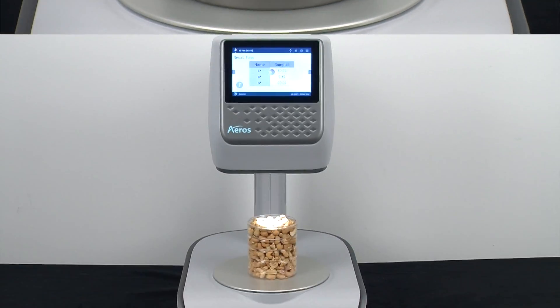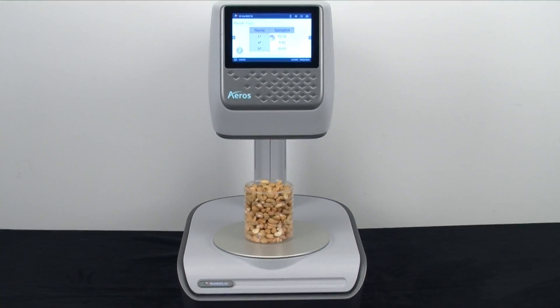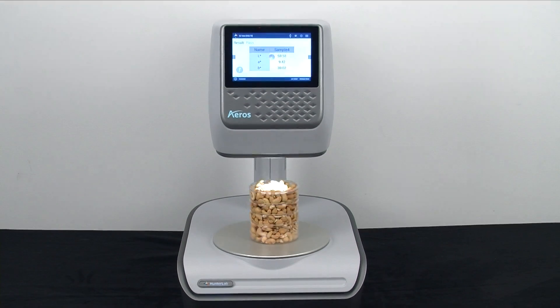Let's measure some nuts, first in their packaging container. If your production process will allow for this, you can eliminate the time and expense of sample containers. See how Eros adjusts itself to the optimal height for measurement?